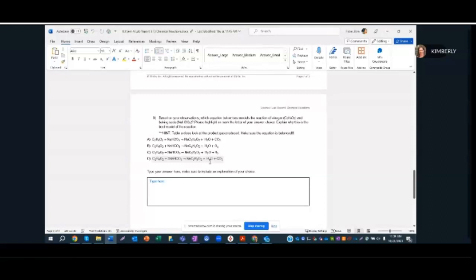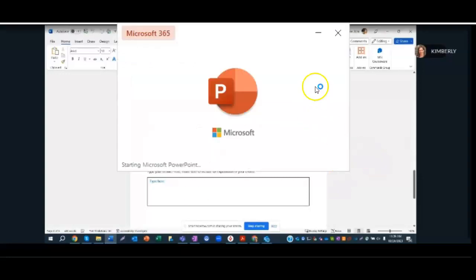So what do you guys think based on the vinegar and baking soda, remembering the gases that were produced? Could have been one of 2, right? 2 of them put out the flame. Do you remember which 2? If anyone wrote down the notes from the flaming splint test, there were 2 different gases that put the flame out.